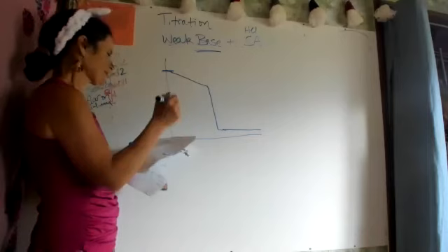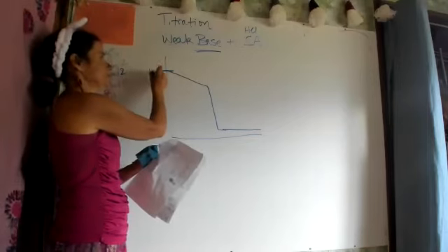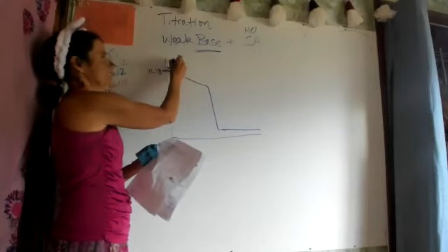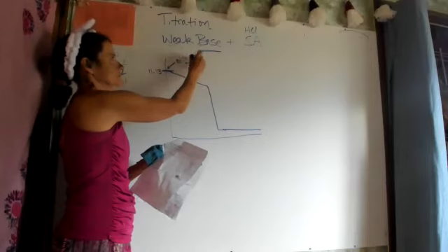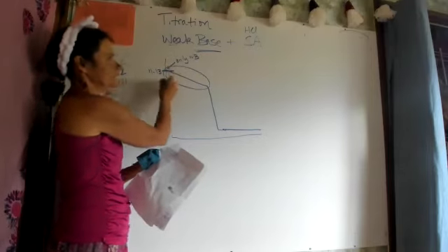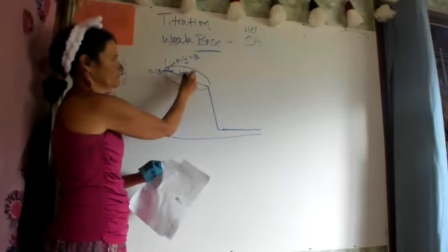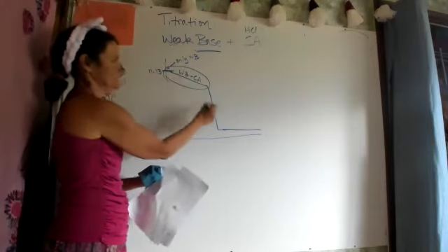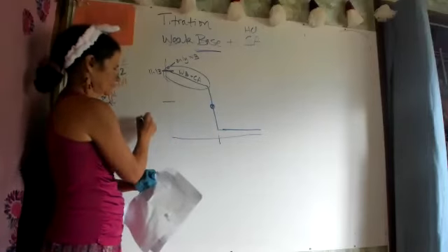All right. So up here, what was my initial was 11.13. This is only the weak base. In here, in that area, we have the weak base plus the conjugate acid. And then this is our most important point, pH.